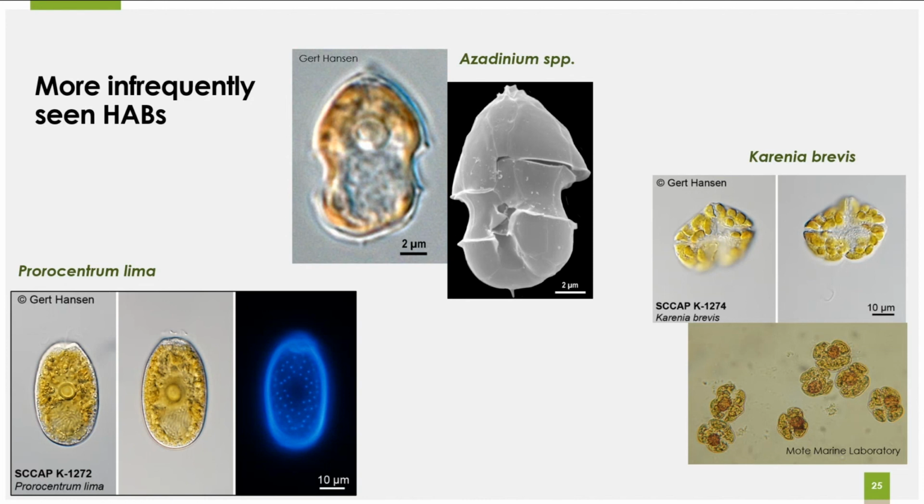This image here is helpful. You can see all the pores. It has this central pyrenoid here, which is this large circle. It has this V-shaped depression here at the top, interiorly. And it's just oval-shaped.